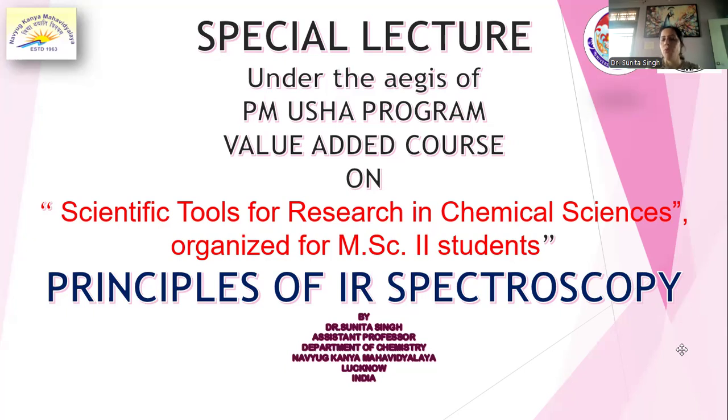At least when you go from MSc to your research, you should know how IR spectroscopy is going to help you for its use. Like IR spectroscopy can be used for determining the functional groups, what IR spectra look like, and what instruments we use in IR spectroscopy.